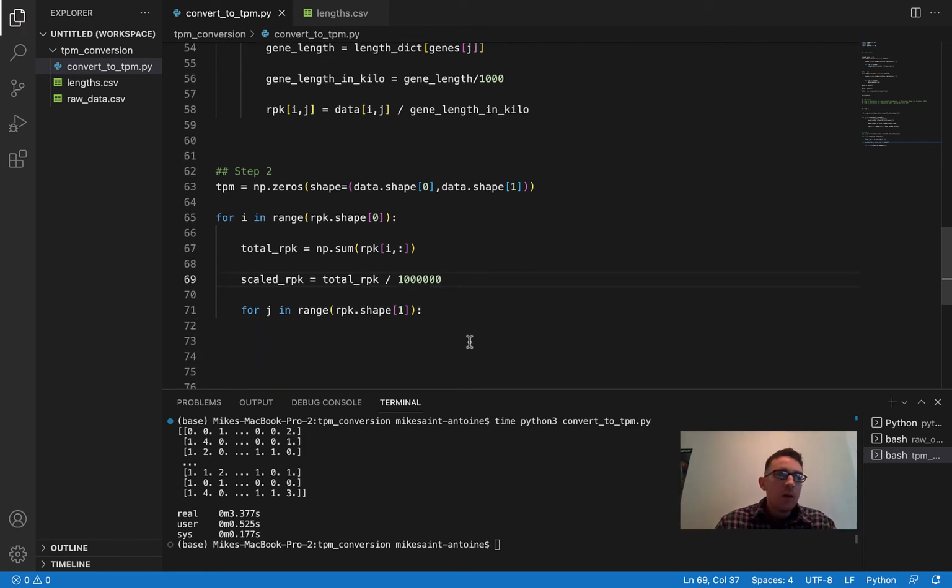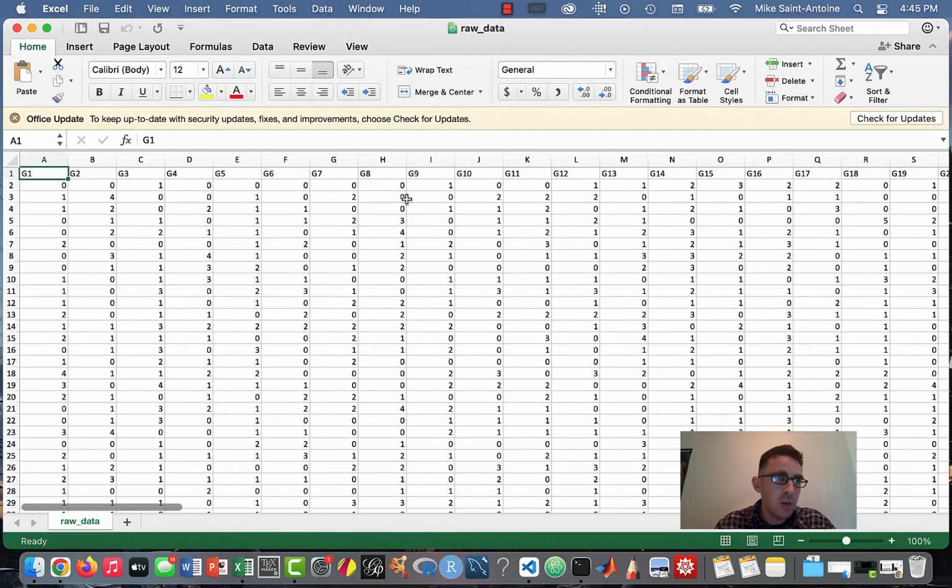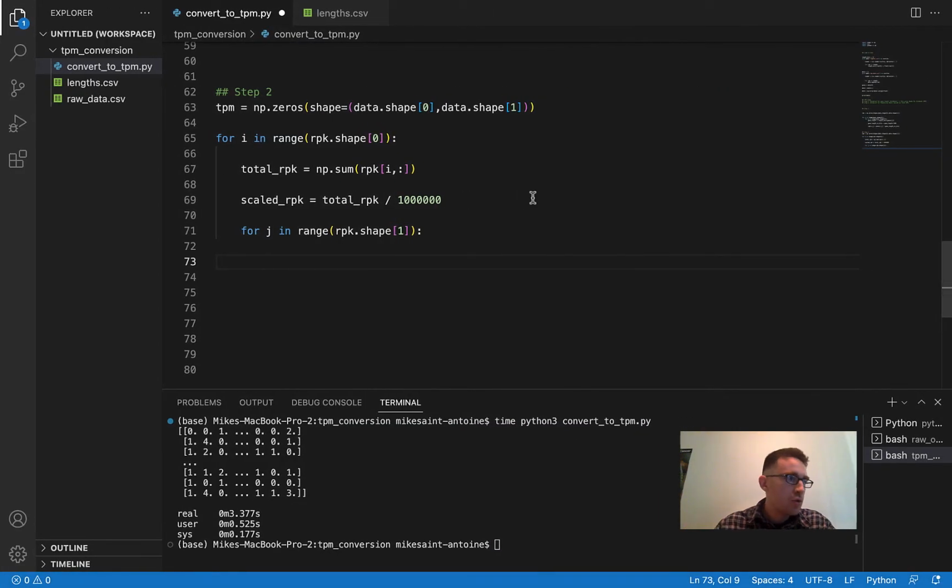Yeah, okay. And here we can take advantage of not having to make all these redundant measurements, because we don't have to do these for every single data point. We can do them in the outer for loop because we're going through all of our samples, and for each sample, these are going to be the same for every column. So we can leave these in the outer for loop to make it a little bit faster. But okay, once we have those, then we're just going to go through all of the columns here. Remember, j is iterating through the columns, and each column corresponds to a gene.